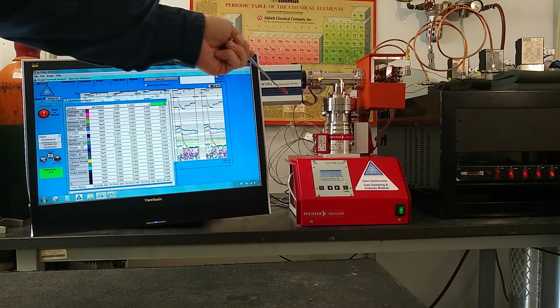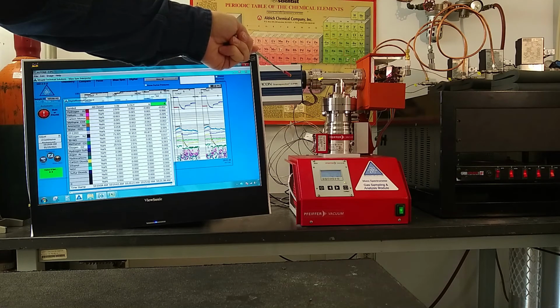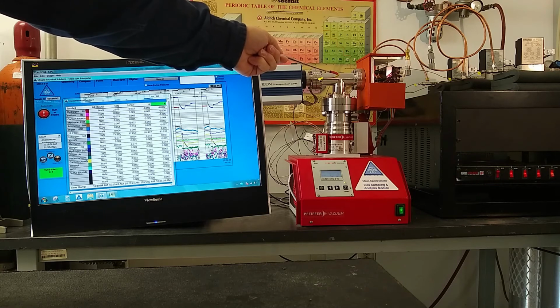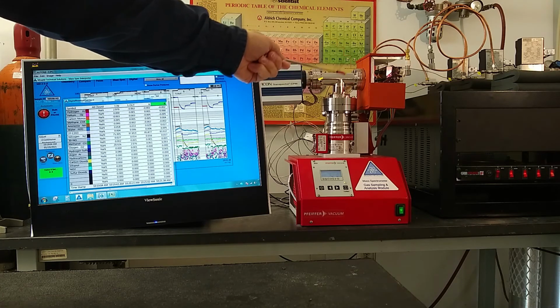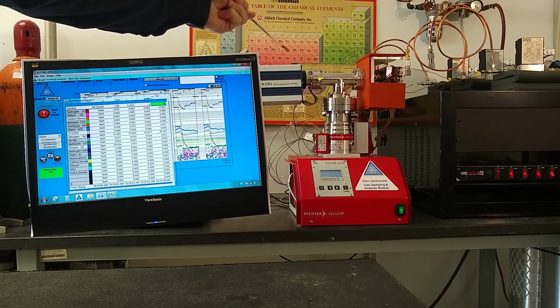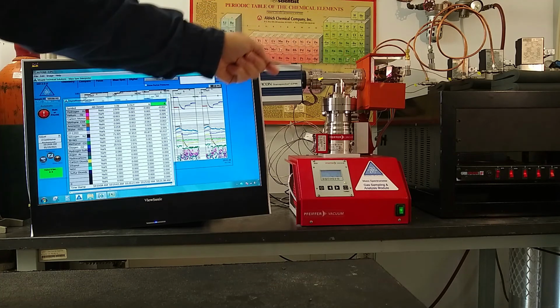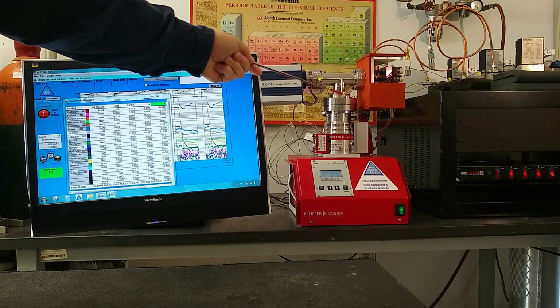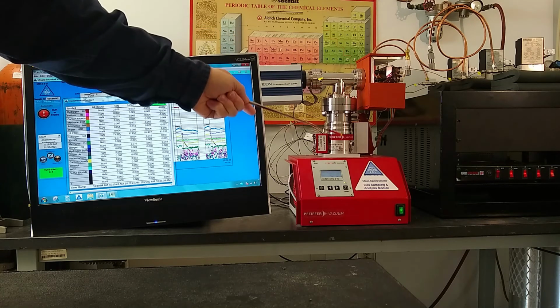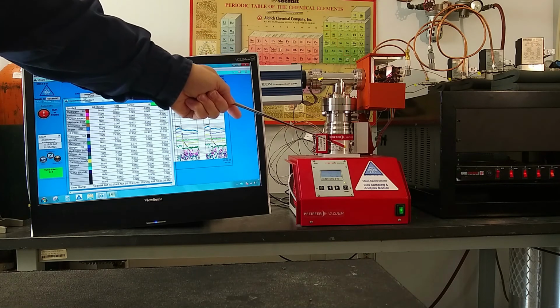What we have is an INFICON quadrupole closed ion source mass spectrometer, RGA. The electronics package here, the sensor located within our sample chamber. Our T-shaped sample chamber has a complex flange interface to the electronics module sensor, to the sample inlet, and to our vacuum station. Our vacuum station is a two-stage turbomolecular pump backed up by a diaphragm roughing pump.